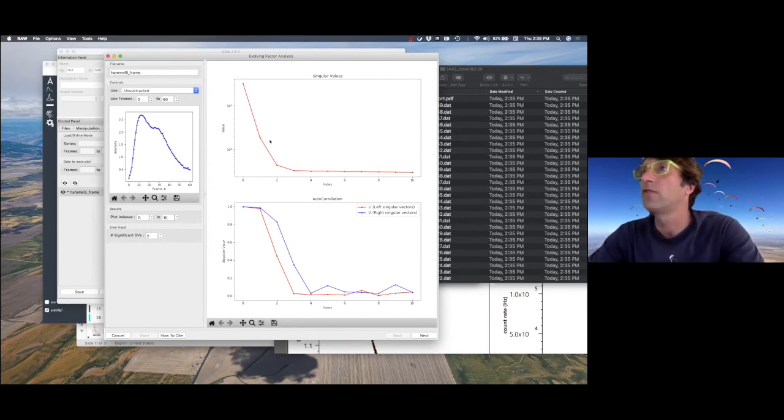So these are the SVD singular values, and see the first and second are very significant. The third is very minimal, so let's forget that one. It could be because of capillary fouling, so we have a slightly different background, but let's not focus on this third one and say I have two significant components under these split peaks. So I say yes, it's 2.